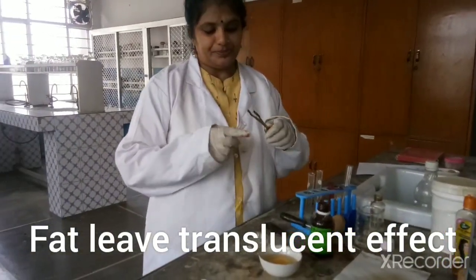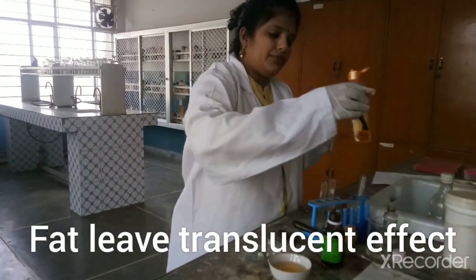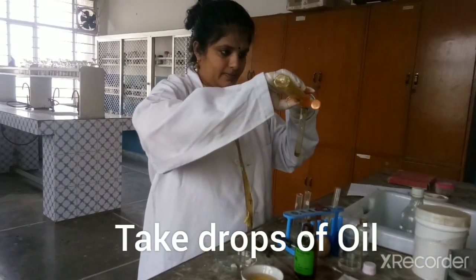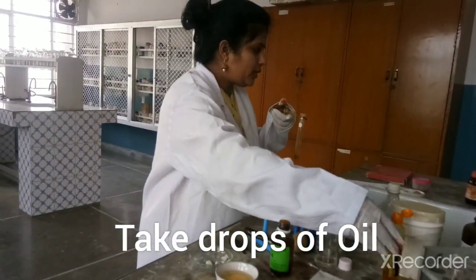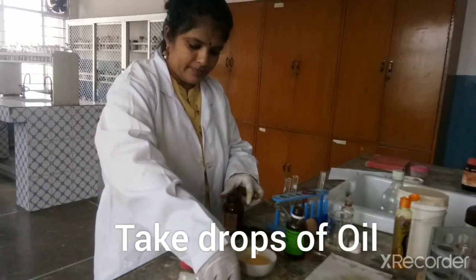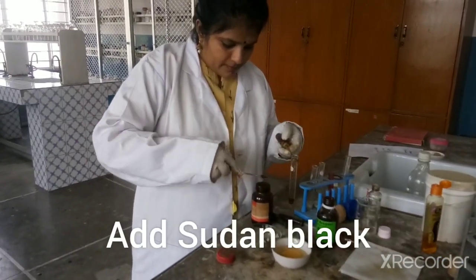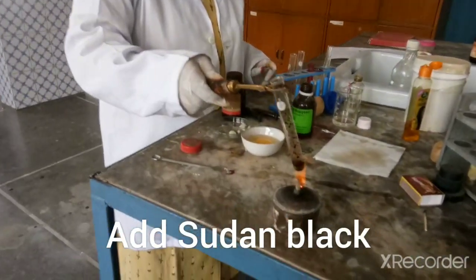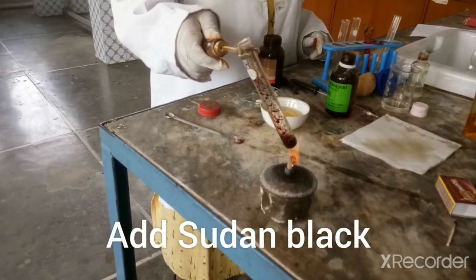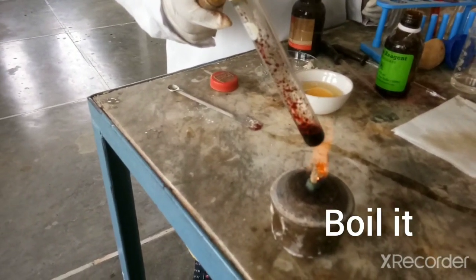Another experiment you can do for fat: take one test tube, fix it with a holder, and add a few drops of oil. Then add a small amount of Sudan Black dye. You can notice small emulsions — a kind of droplets of fat — in the test tube. This is due to the emulsion formed by the fat.